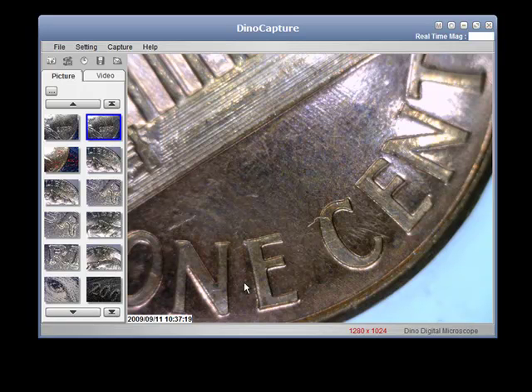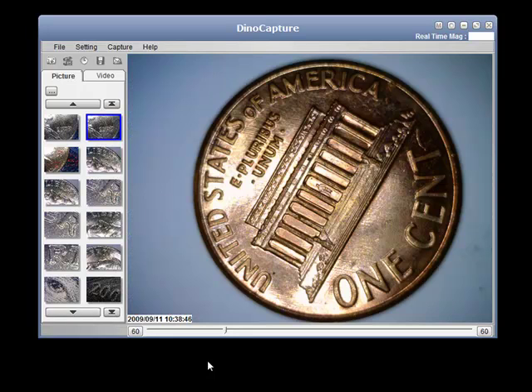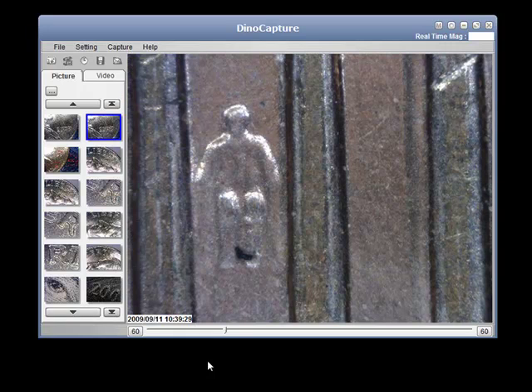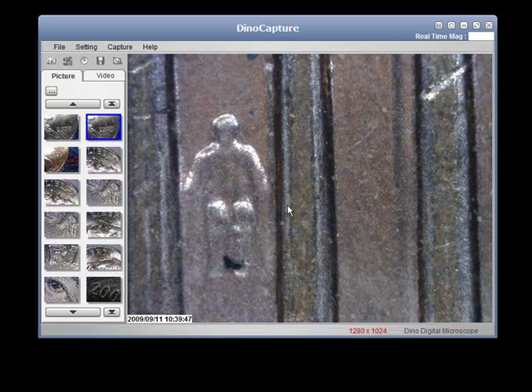There's an exposure adjustment bar at the bottom of the screen, and this is the default button. Most of the cameras can optically magnify from 10x to 220x. This is 20x, this is 50x, this is 200x. To digitally magnify, use the scroll wheel on the mouse.